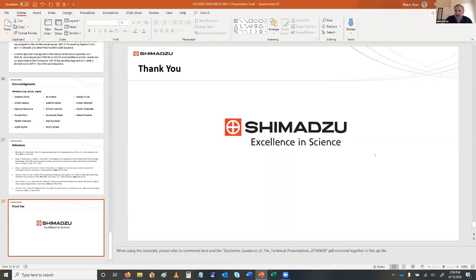And I can ask a question or two here. So I know Shimadzu has a whole product line of LCMS instruments. Is there any prospect for coupling your multi systems like this one to some kind of separation up front? So essentially the separation up front would have to be done offline.